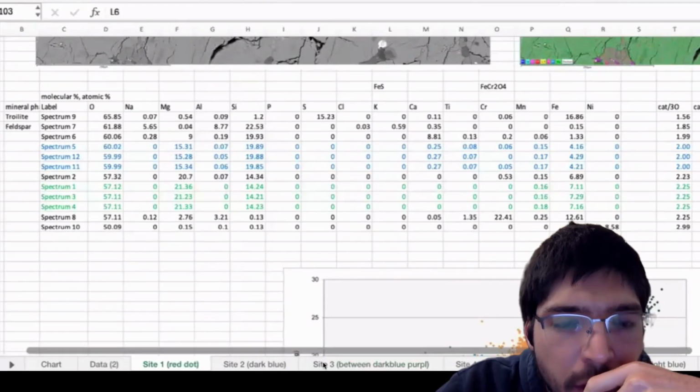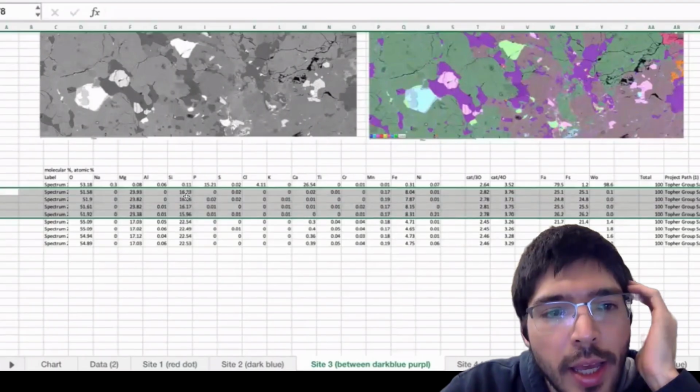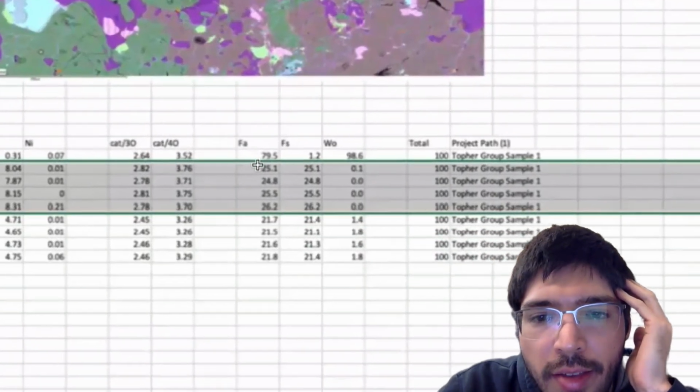So I'm going to go back and double check the data to make sure during the processing there wasn't anything that could change this. Sometimes when I do the processing, if there's a correction involved, that can actually affect these numbers. But what I tend to notice is it doesn't affect these numbers so much.